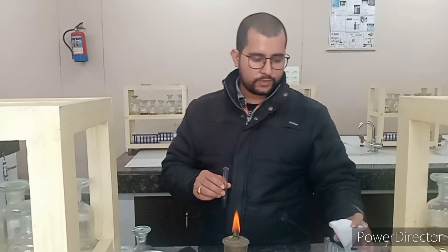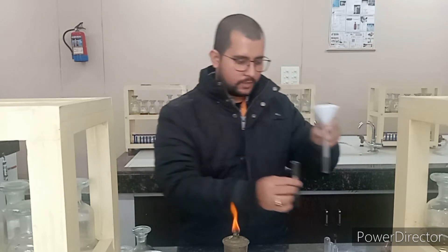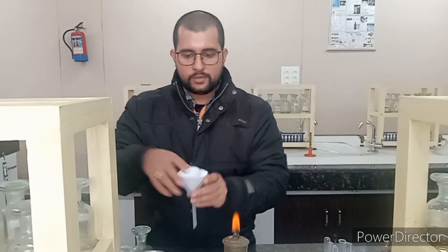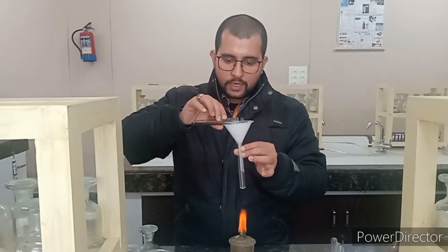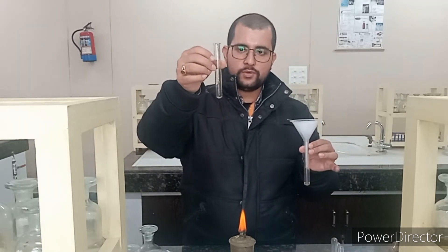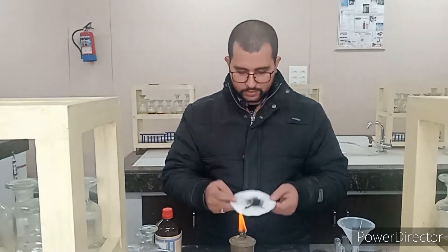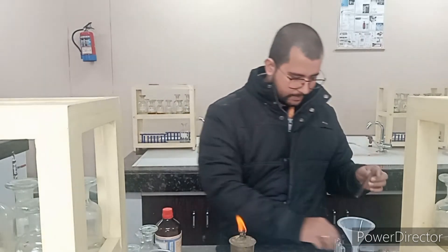Now we will filter it out into another test tube using this setup with Whatman filter paper. I am slowly adding the sample — let the paper be wet first, then add the sample so it goes to one place and does not spread, and we can collect it carefully. The black precipitate is here on the filter paper. I have taken it out and will take a small amount of black precipitate for further testing.